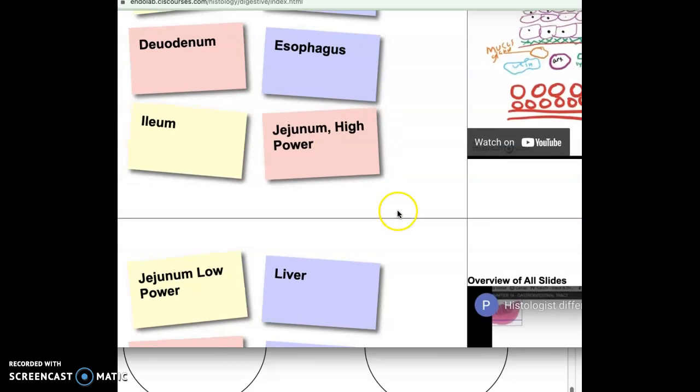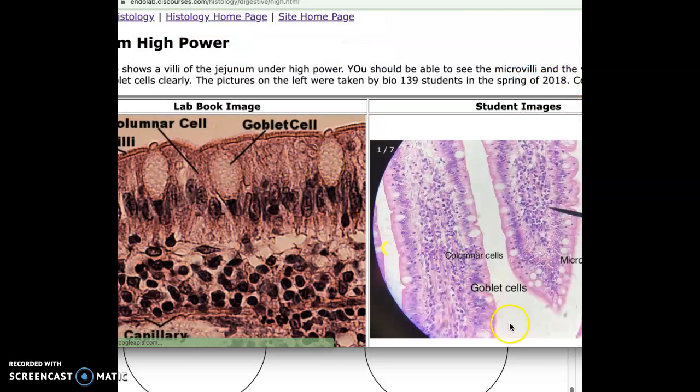Then on the high power one, you're looking at this. You are looking at the villi here. And there are these cute little cells called goblet cells. So see goblet cells. Isn't that pretty? Yes, that one is identical to that one. I discovered the clone tool. So these are the goblet cells.